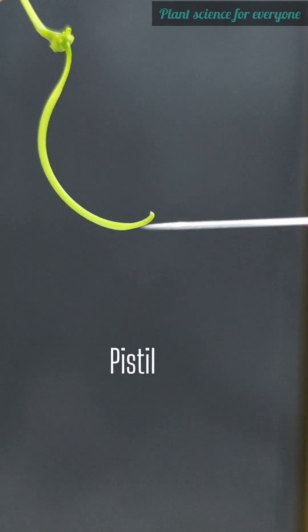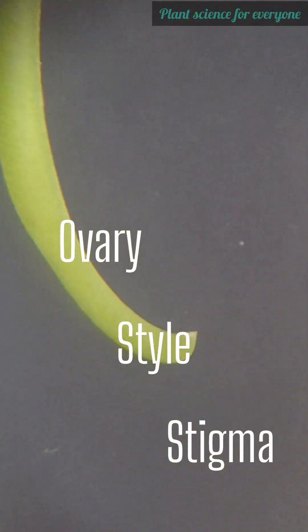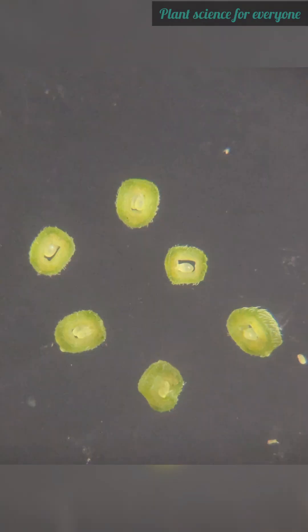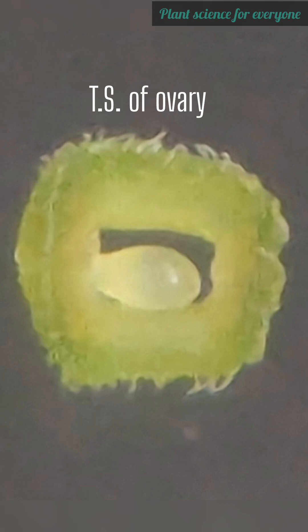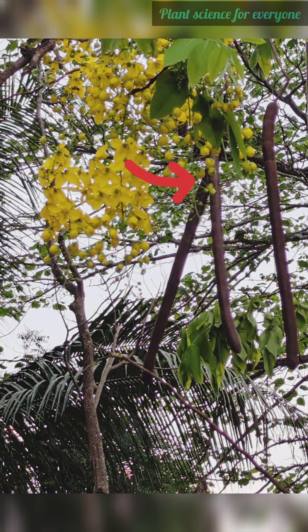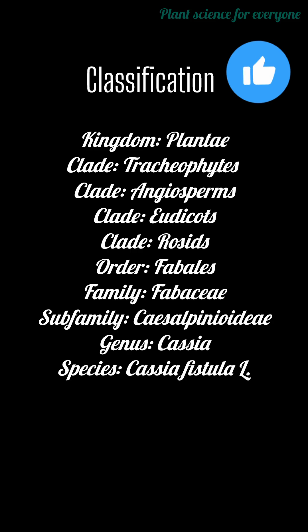This green curved part is the pistil — the flower's female organ. It has a long, slightly hairy ovary, a short style, and a stigma at the tip to catch pollen grains. In a longitudinal section of the ovary, many ovules are arranged along the margin. In a transverse section, the unilocular ovary looks like this. The fruits are long cylindrical pods — called 'sonaru' in Assamese, 'amaltas' in Hindi, 'sarakondrai' in Tamil — the Indian laburnum, Cassia fistula.